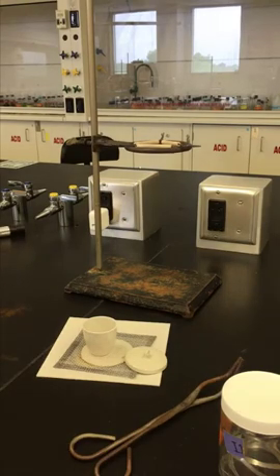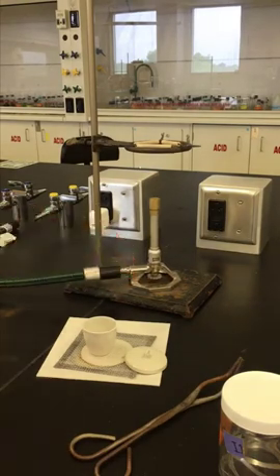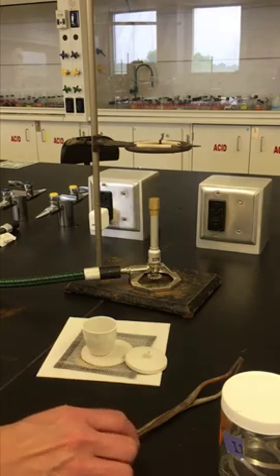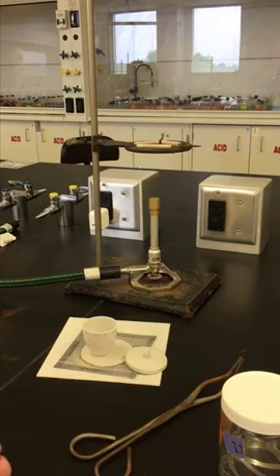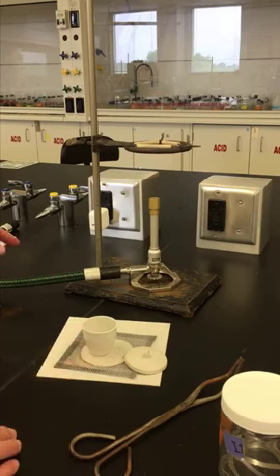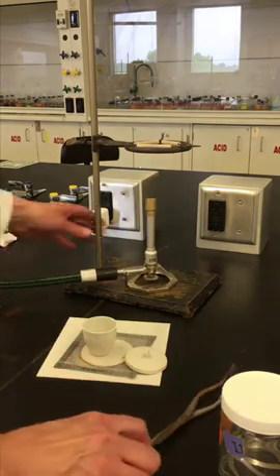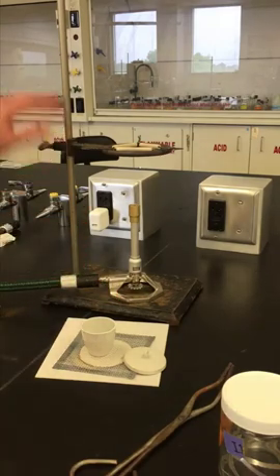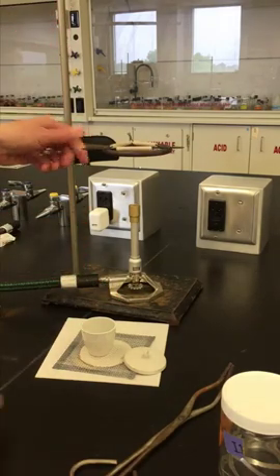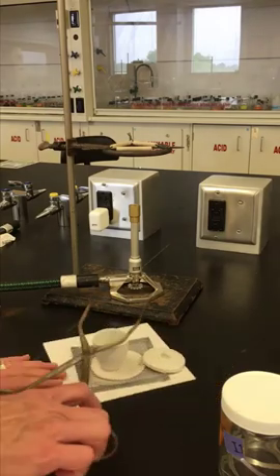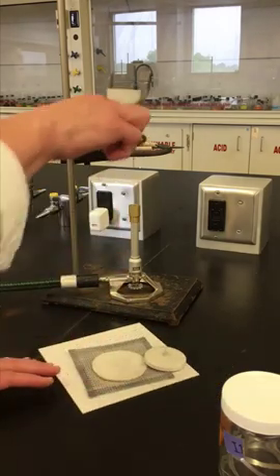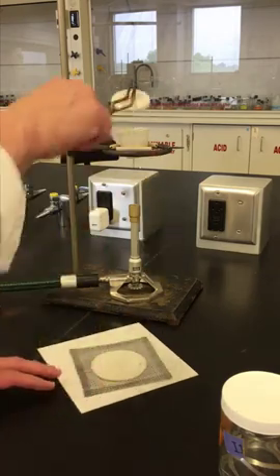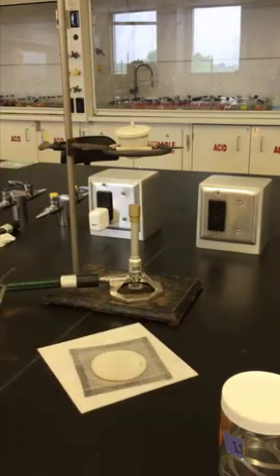We will also need a Bunsen burner because that's how we are going to heat our crucible and of course a striker to light the Bunsen burner. This will be our setup where we will have the Bunsen burner on the ring stand. On the base of the ring stand you have your ring support and the clay triangle. And then we're going to put our crucible with our lid on top. And that will be our setup to heat our magnesium in the presence of oxygen.